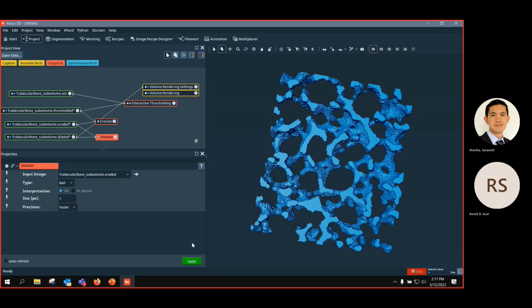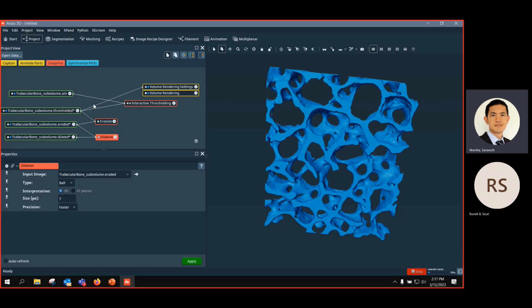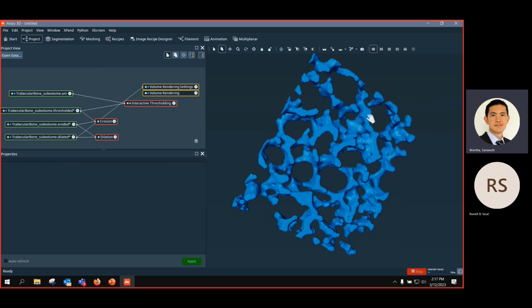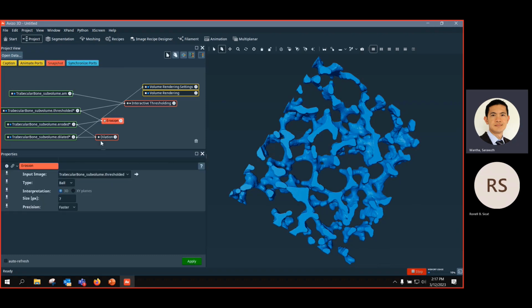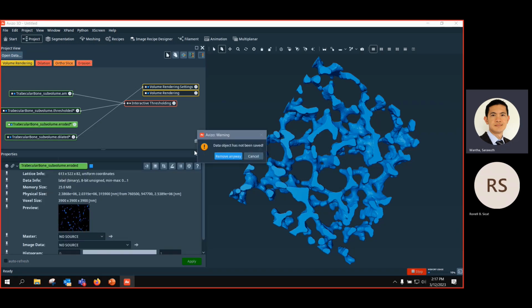And this, you can see that before we have an object like this here, and then we just break them, and whatever we break, we get different parts, separated at the thinning point. And I show you this because they have some options. You can do erosion and dilation, and all of them in combination is called opening. So instead of using erosion and dilation, you can also easily do so-called opening.